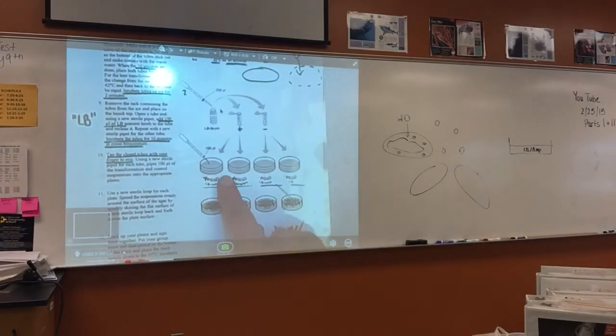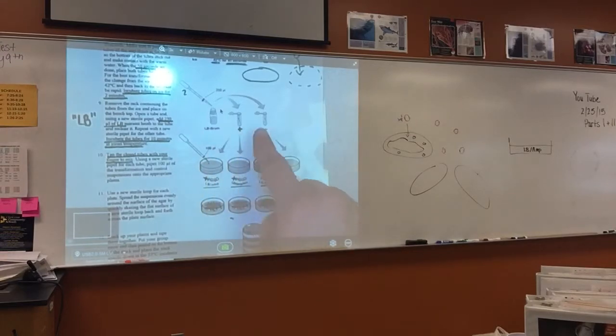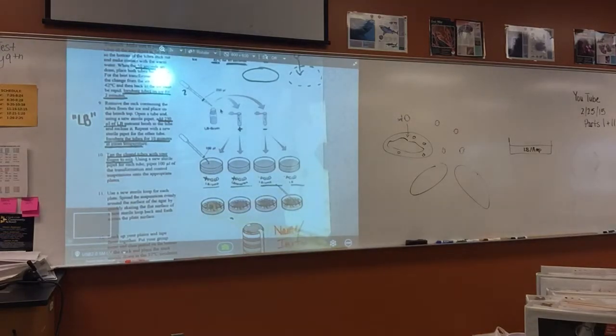You're going to have this clear solution on the plate. You're going to use a new pipette for each one. Then you get to spread it around, using a new loop. Notice the lines here: spread it this way, this way, this way, as much as possible. When you're done with that one, get rid of that loop and do the next with another loop, and so on. Then you have your bacteria all ready to grow.